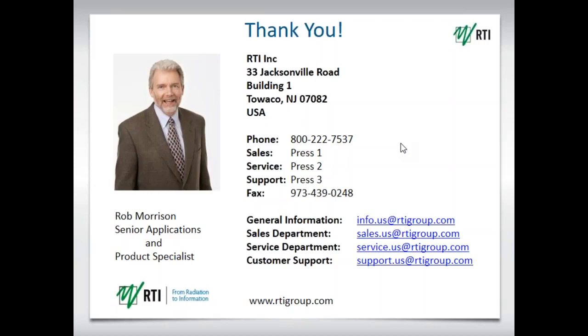There may be some service releases in between, but the 2 major releases are typically twice a year. And one of the nice things is if you have Ocean software, you can check for updates if you're connected to the web. When you start Ocean, if there is a new update, it'll prompt you and say there is a new update of software available if you'd like to get it.